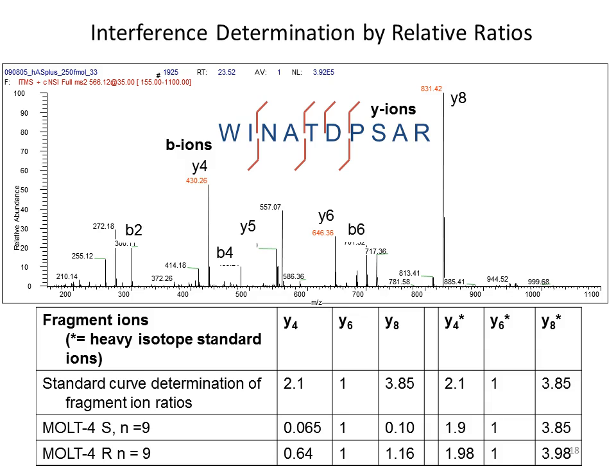And this was a lesson I learned hard in grad school, where I was monitoring a peptide and looking at 2 different cell lines. One was drug resistant, one was drug sensitive, and I was looking at these ratios. I took the Y6, just chose one at random, the smallest one I guess, and normalized the intensity of the others to the Y6, so everything's a bigger number.